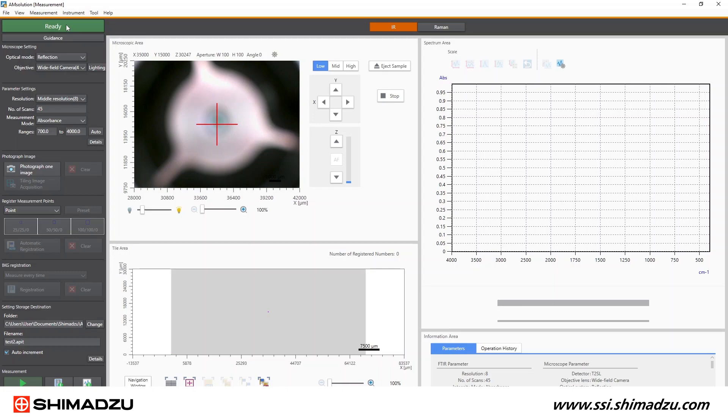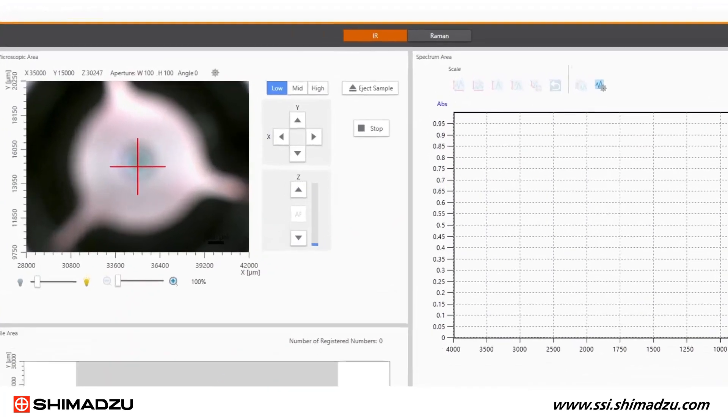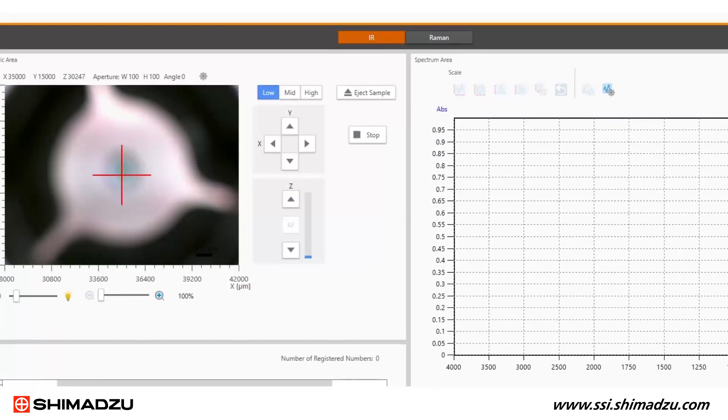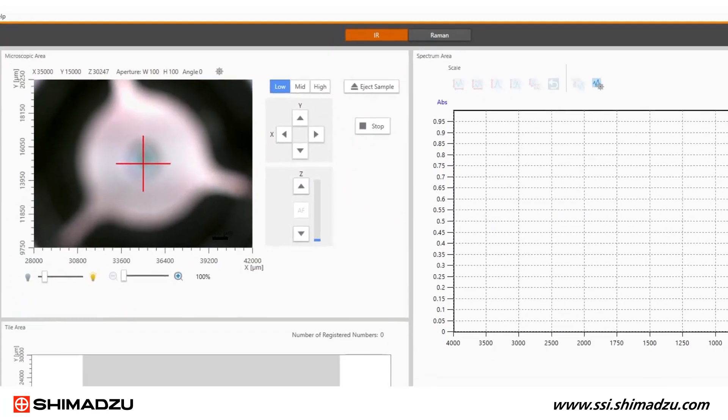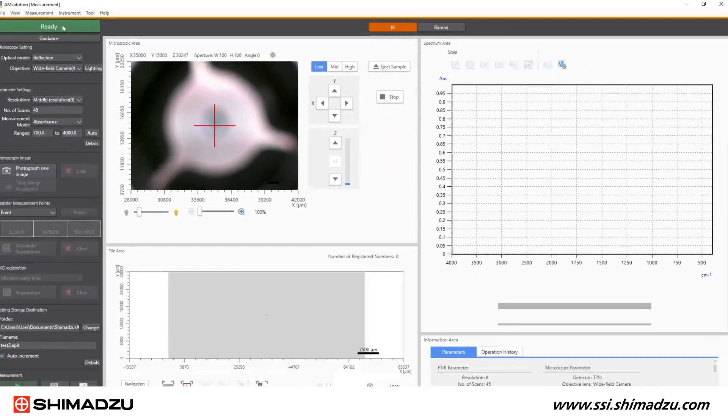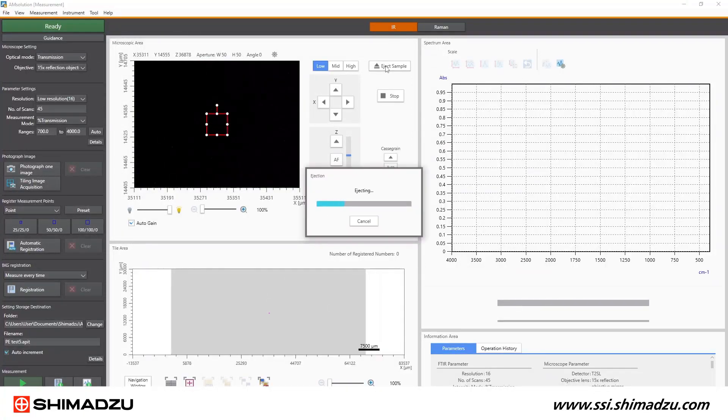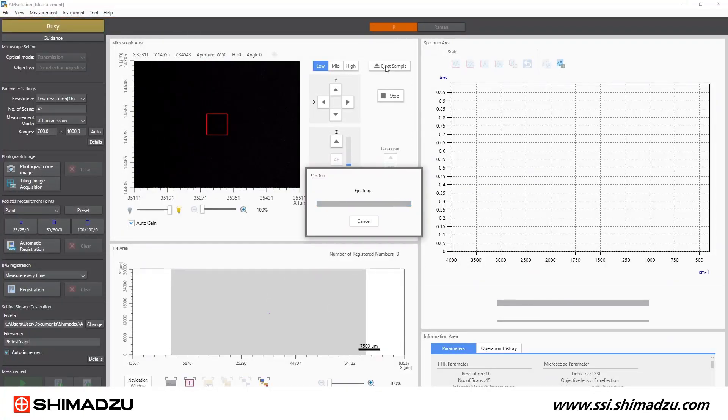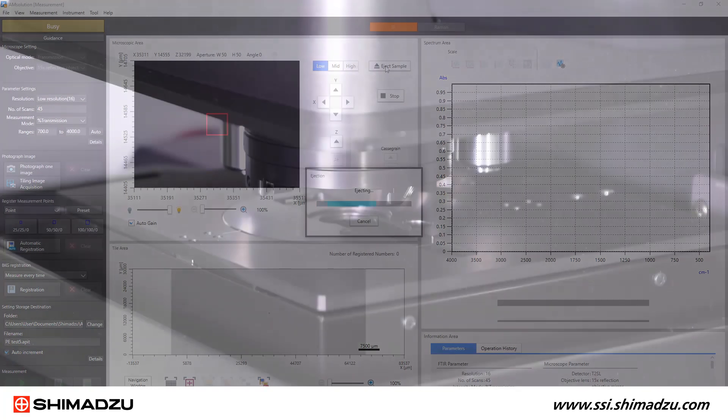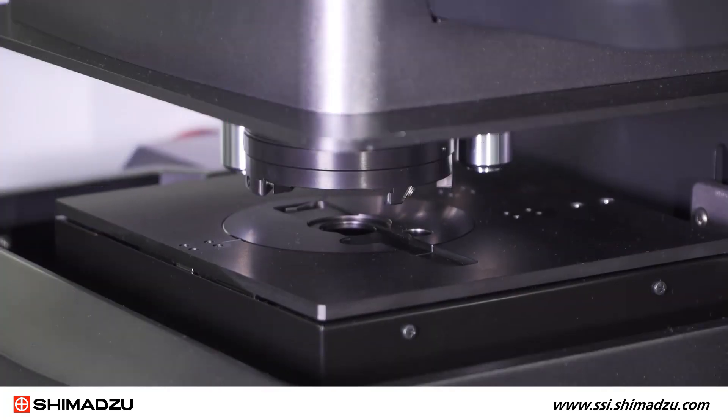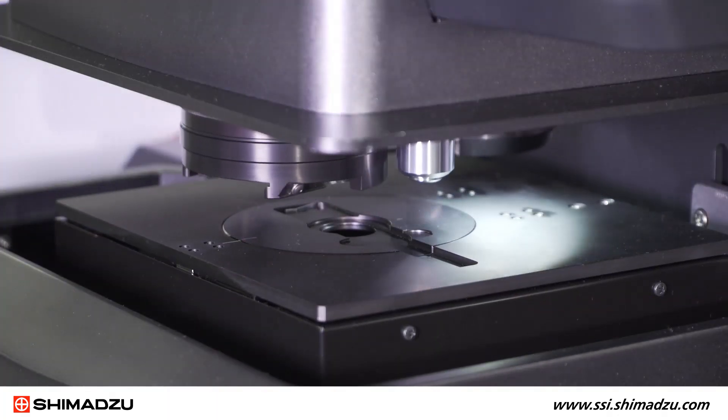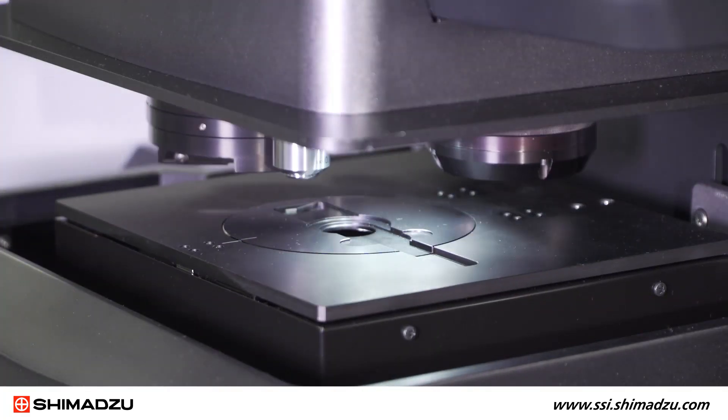Let's start by selecting the orange IR button at the top of the screen to start the IR measurement process. I like to click eject sample whenever I place a sample on the stage because this lowers the stage and rotates the objectives out of the way.